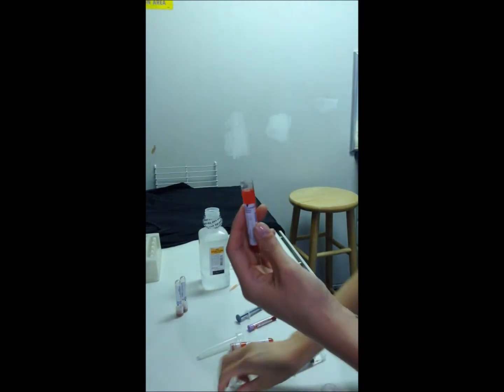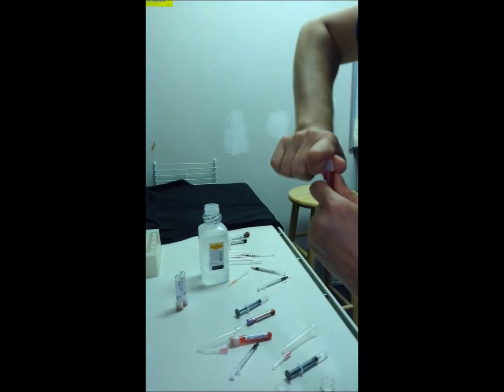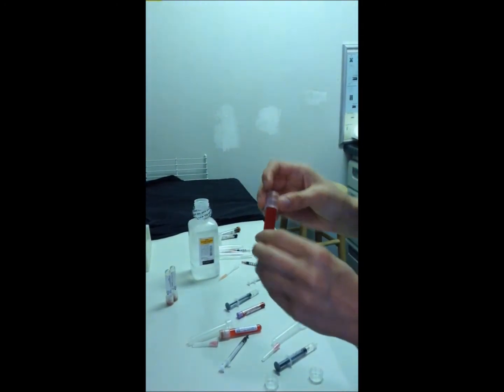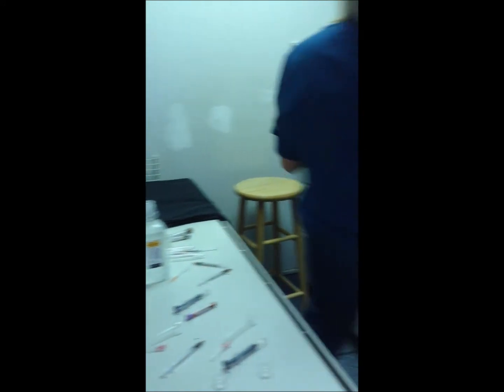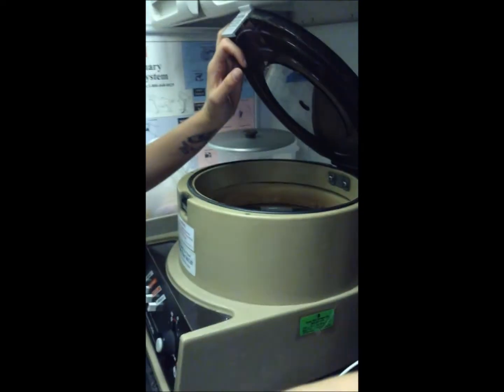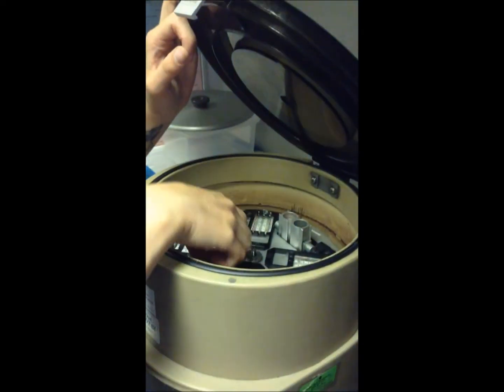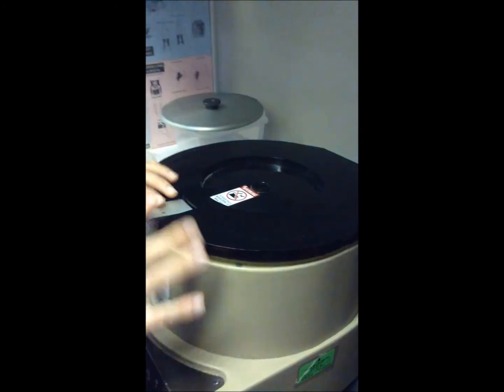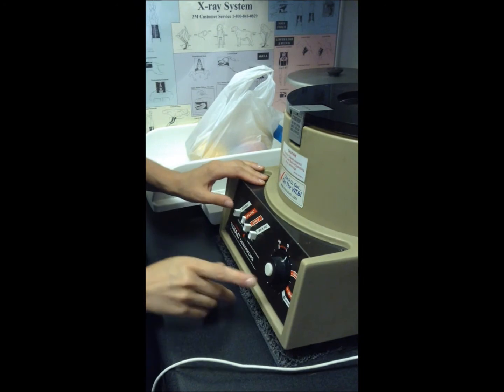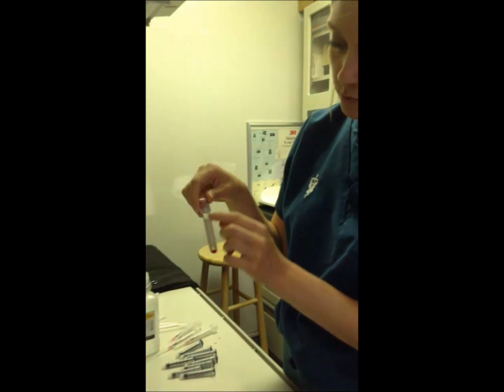Okay, and then we're going to mix that, and we're going to spin both of them down for about 1 minute at 3,400 RPM. All right, so we're going to spin these down. Same thing as last time. You're going to do it evenly, one on this side, one on this side. Close it and spin it for 1 minute.